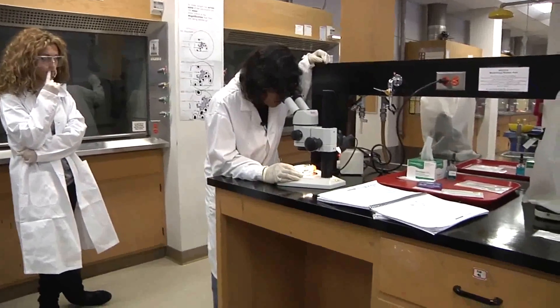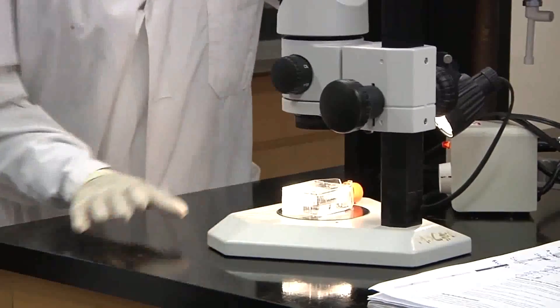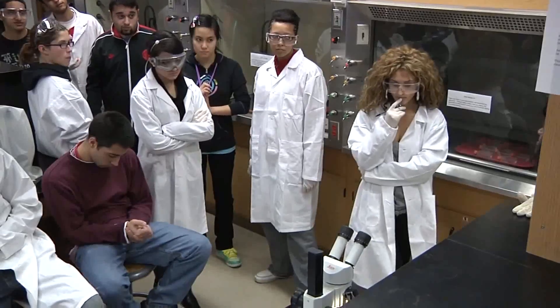So I have specimen number 2 in focus right now, so every one of you can actually have a first look at it, one by one.